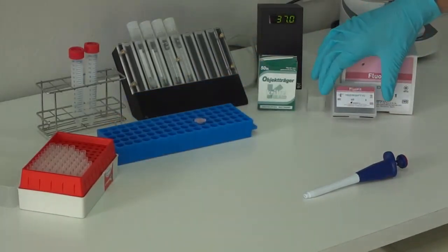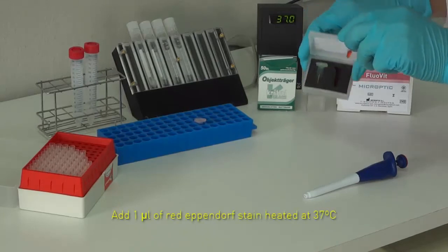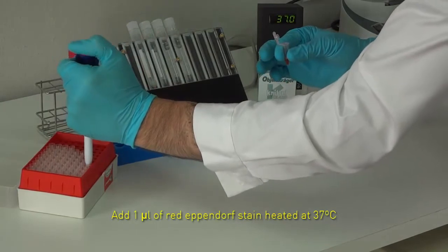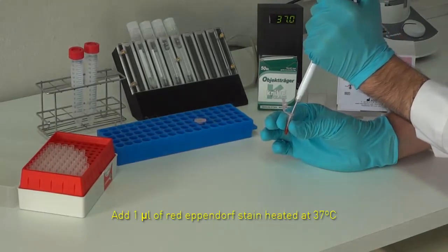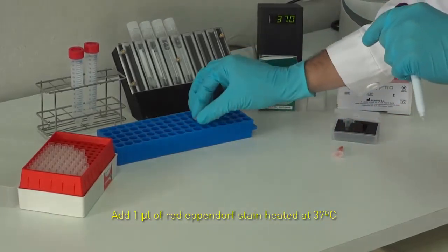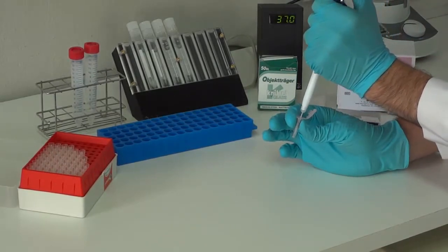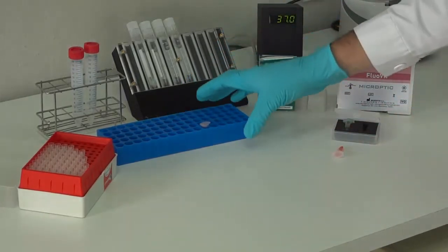Take off the Eppendorf from the incubator and add 1 microliter of red Eppendorf stain previously heated at 37 degrees centigrade. Mix gently with the micropipette and keep the Eppendorf in the incubator at 37 degrees centigrade for 5 minutes.